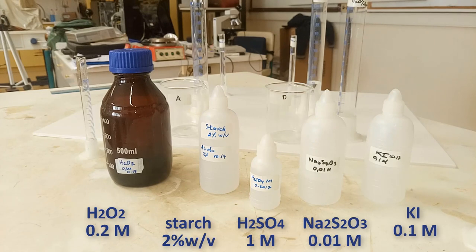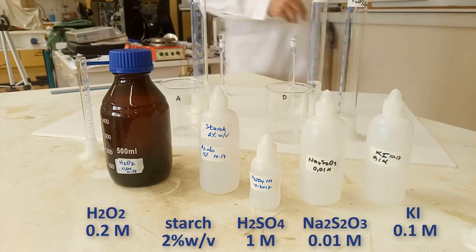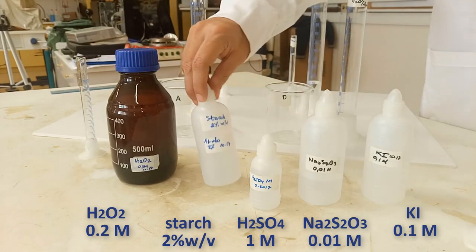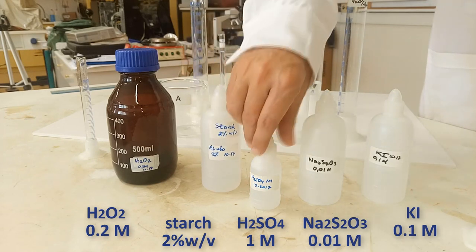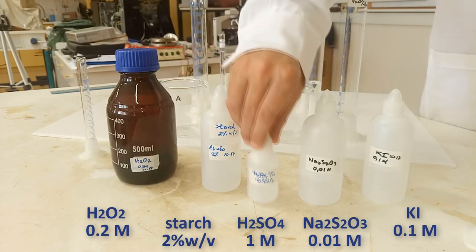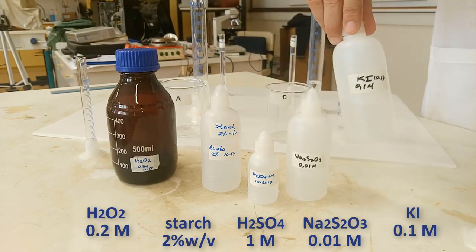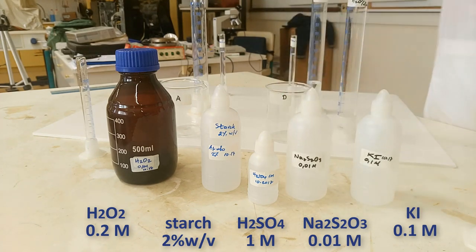In this version, we use relatively simple materials. A hydrogen peroxide solution of 0.2 molar, a fresh 2% starch solution, 1 molar sulfuric acid, 0.01 molar sodium thiosulfate, and 0.1 molar potassium iodide.